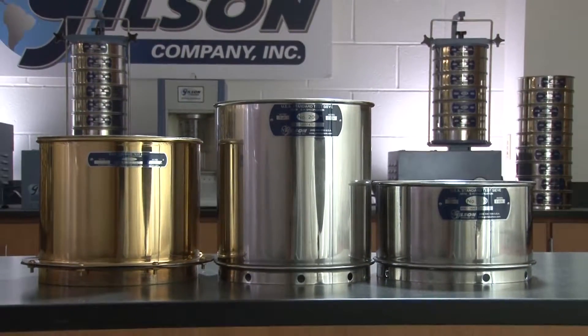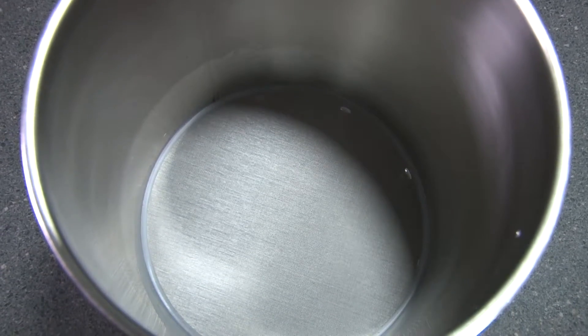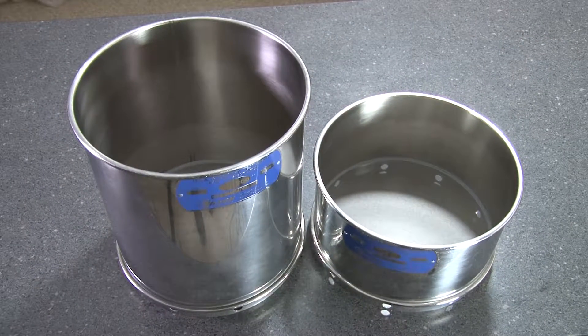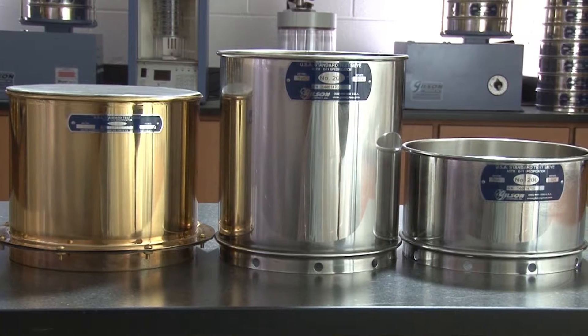Gilson also offers deep frame wet wash sieves with deeper frames to help minimize water and sample loss during agitation. These rugged sieves with stainless steel mesh come in either traditional brass frames or all stainless steel frames.